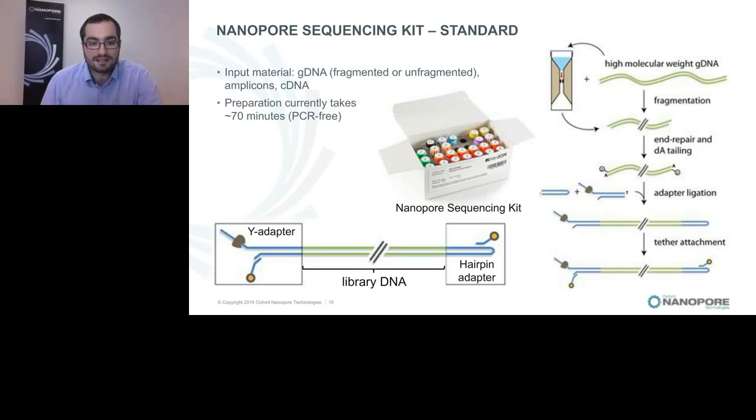After you've ligated on your adapters, we perform an enrichment step where we select for hairpin-containing molecules. This allows us to maximize the yield of 2D reads. So these are the reads where you observe both the template strand and its reverse complement.